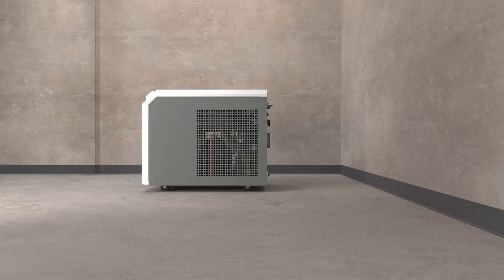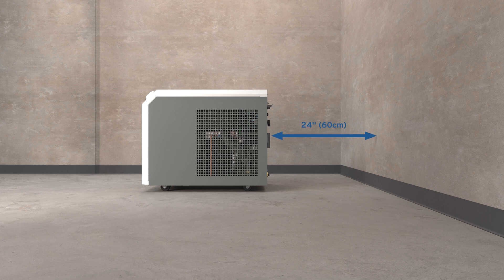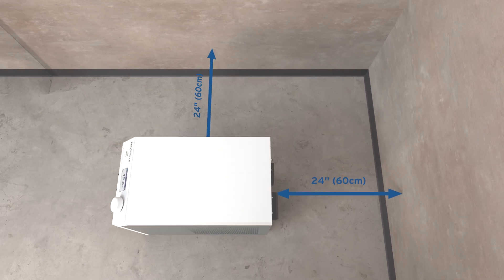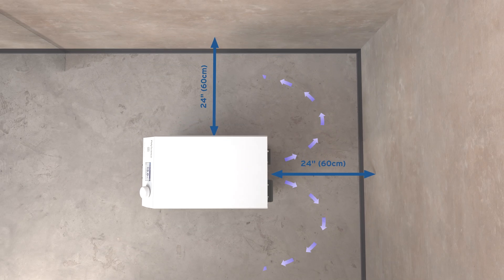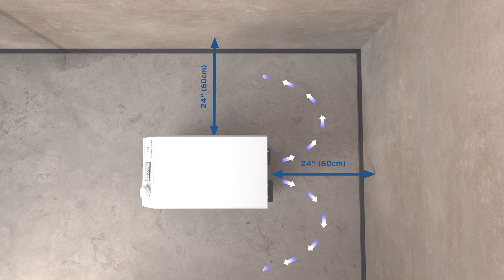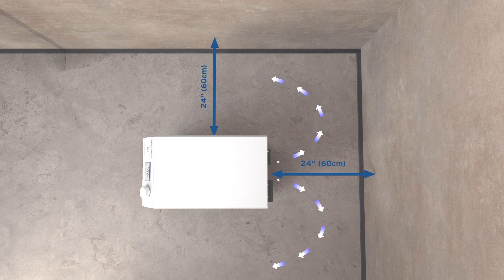Be sure that there is at least 24 inches or 60 centimeters of space on all sides of the chiller to ensure good airflow. The chiller needs good airflow to ensure proper cooling.